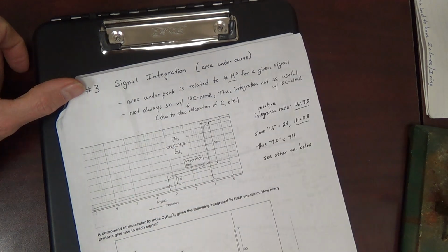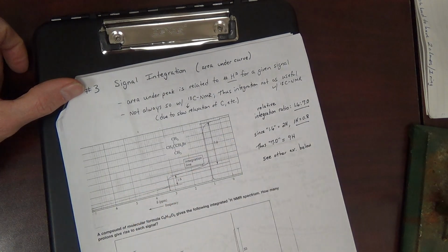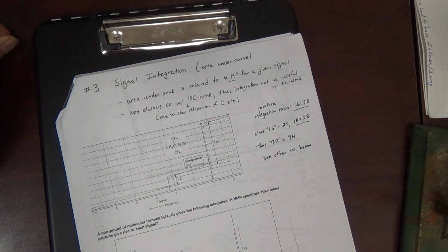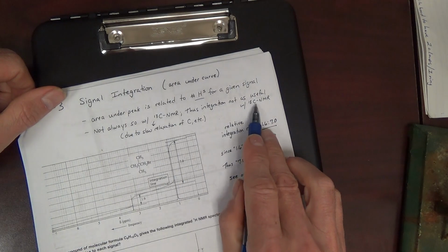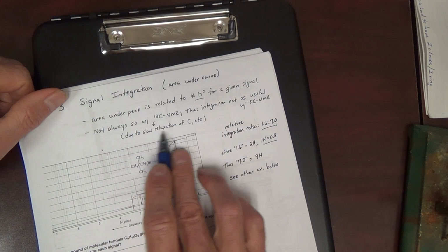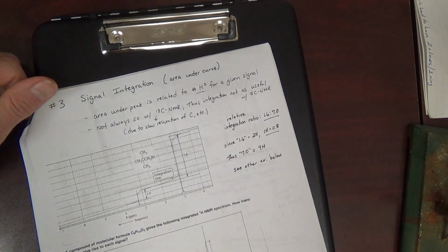That's just another way to state it. Now, this does not always apply for carbon NMR, but it does apply very well for proton NMR. Integration is very commonly used for proton NMR. Integration is not as useful for carbon NMR, and this is due to the slow relaxation of carbon. But we will mention this later once we get to carbon NMR.